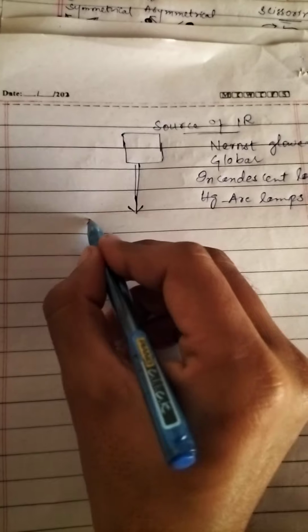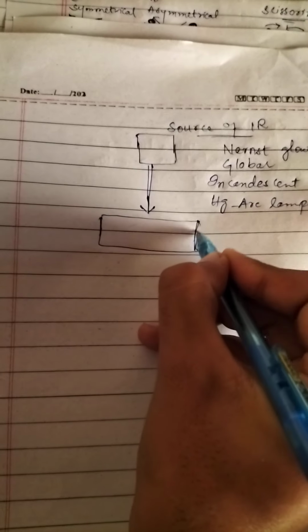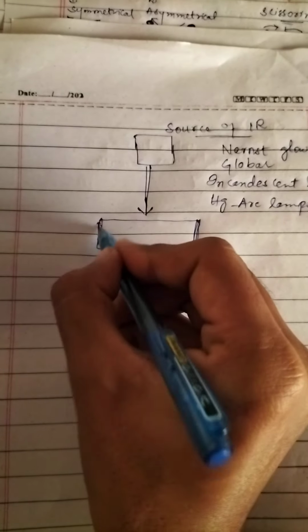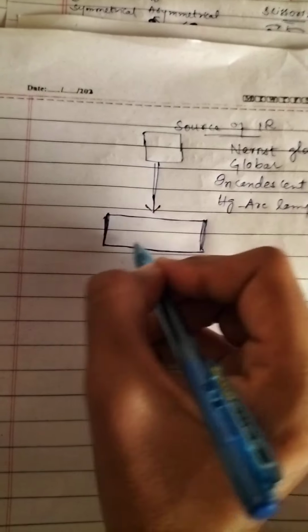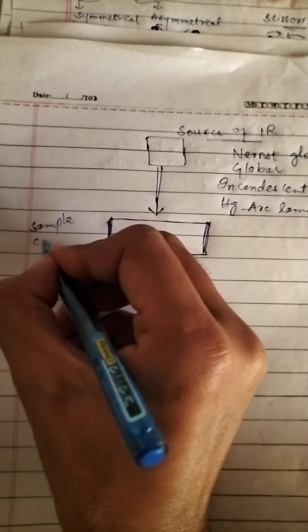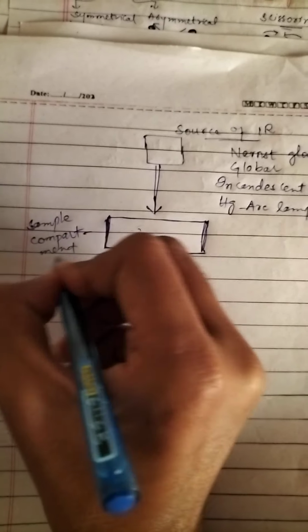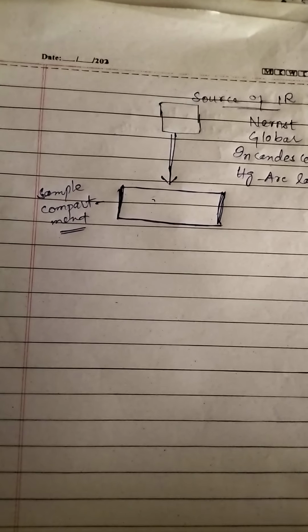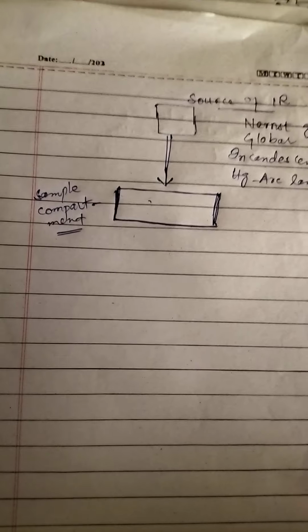Here is the sample compartment, in which the compound or substance for which we are going to determine the structure is placed. In the sample compartment, there are two cuvettes. One is for the reference sample and the other for the sample.